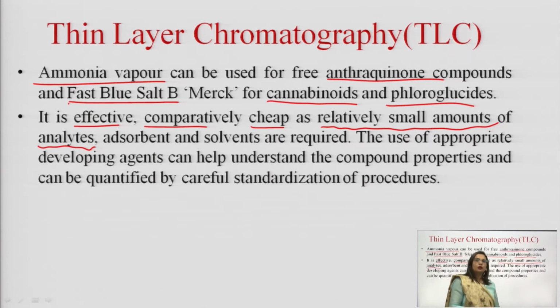This TLC can be utilized day-to-day in a routine manner. We can utilize thin layer chromatography for analysis and research purposes. That makes it handy and more advisable.